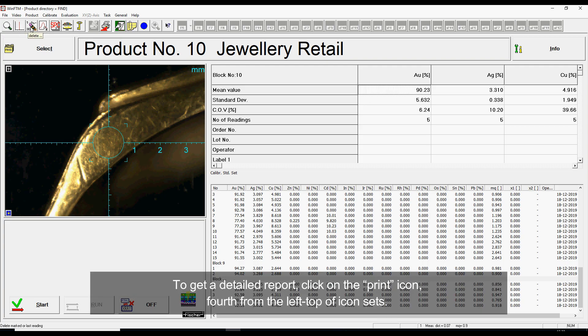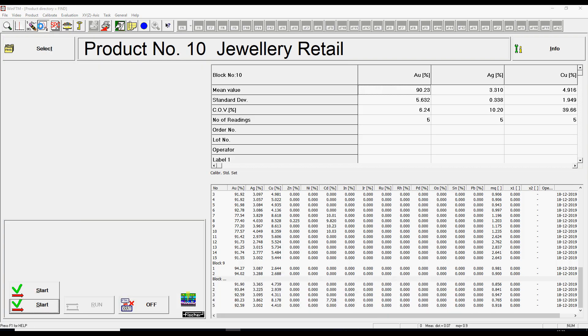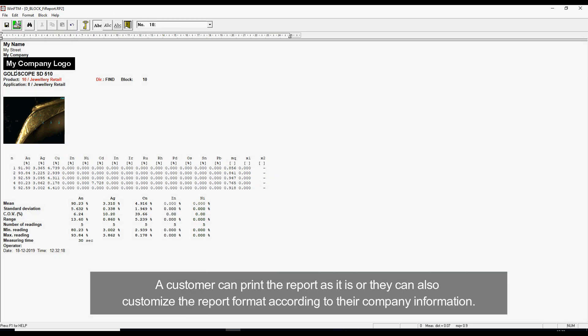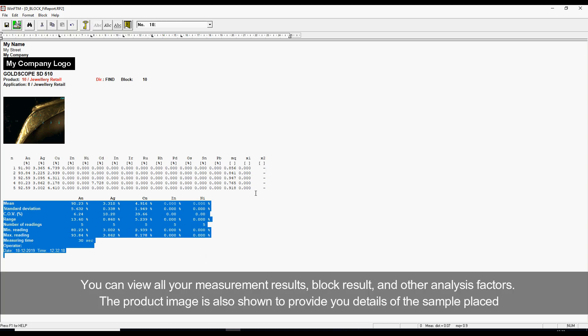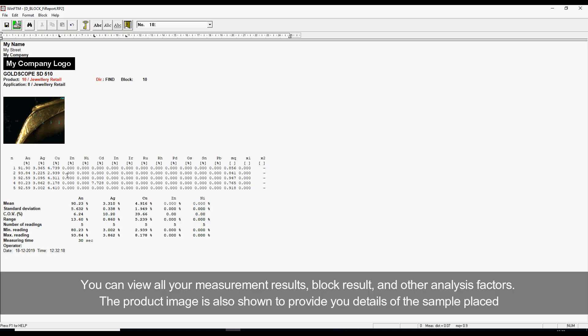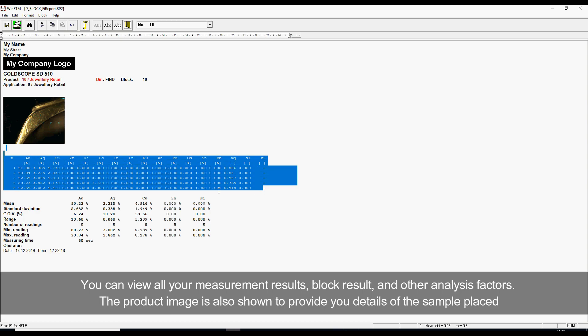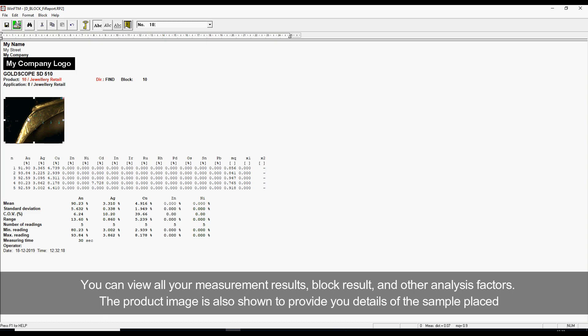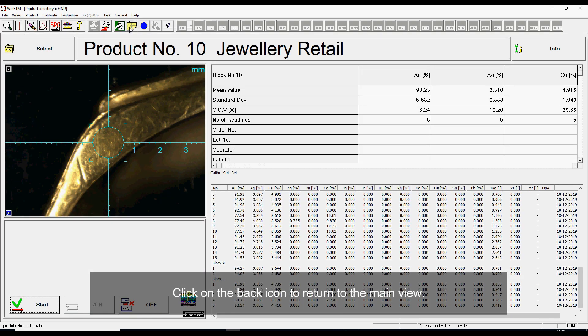To get a detailed report, click on the print icon, fourth from the left top of the icon set. A customer can print the report as is or customize the report format according to their company information. You can view all your measurement results, block results, and other analysis factors. The product image is also shown to provide details of the sample placed. Click on the back icon to return to the main view.